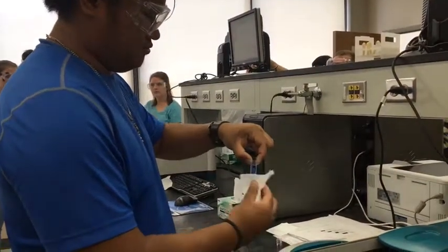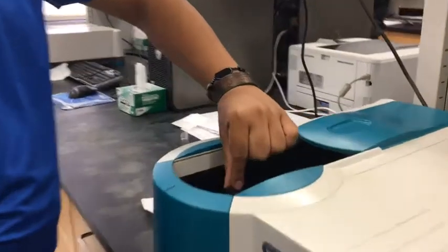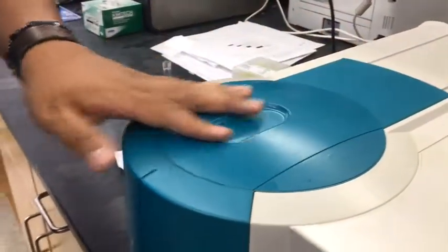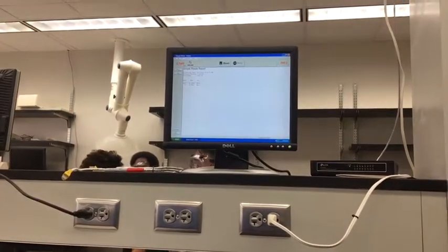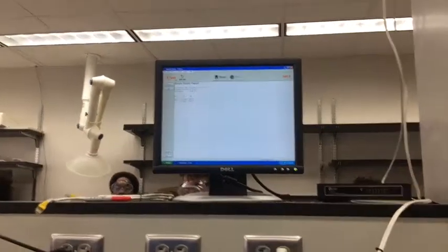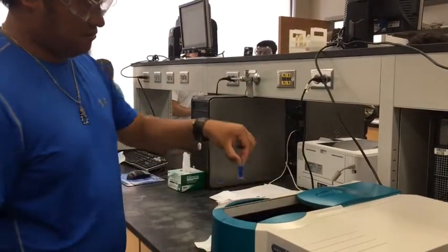Here we are obtaining the absorbance of the stock solution. We will first wipe the 2 sides of the cuvette and then place the cuvette into the spectrophotometer. The clean sides are facing the beam. For closing the lid, we will press the read button to get the absorbance and then record it in our lab notebook. Now we will open the lid and carefully remove the cuvette.